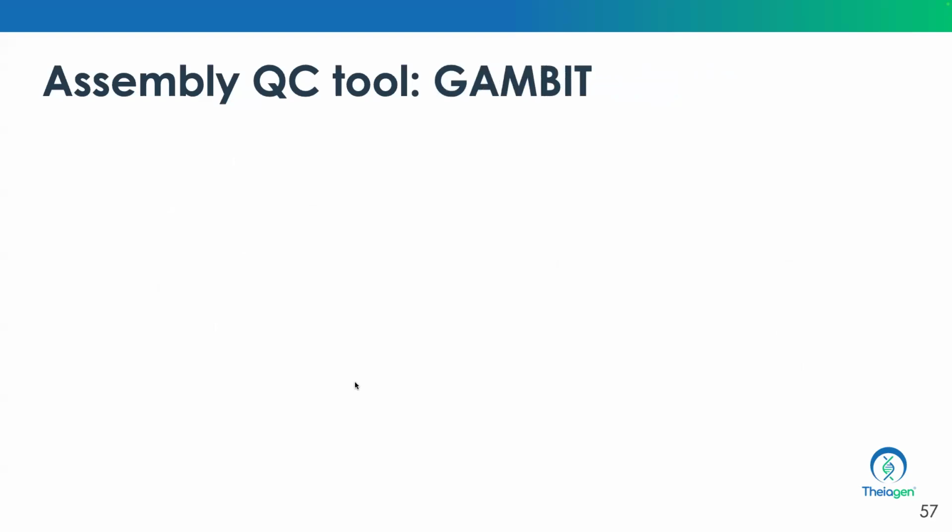Again, we'll go through each of these in more detail when we actually look at the table in Terra and look at each sample and just assess the quality.